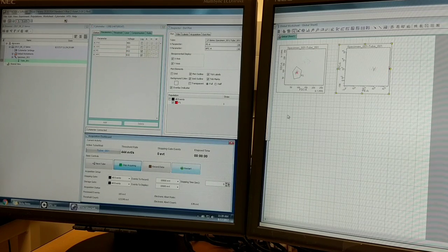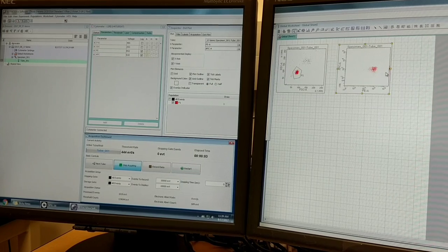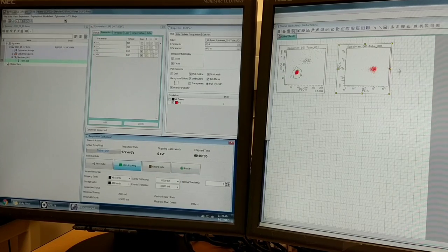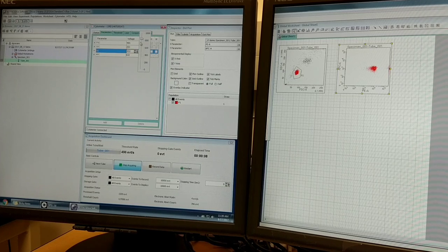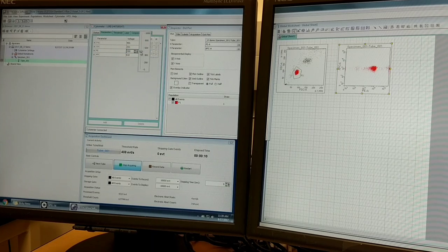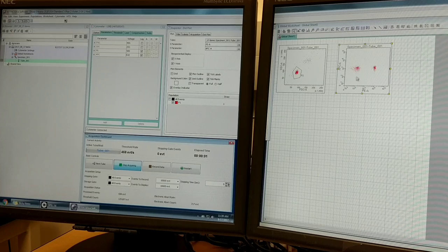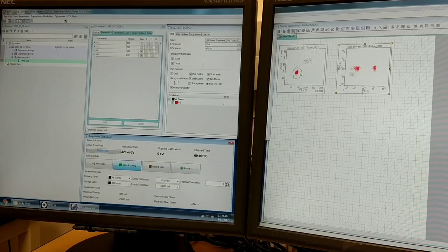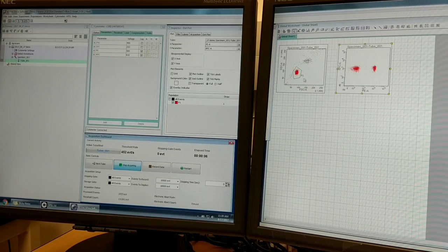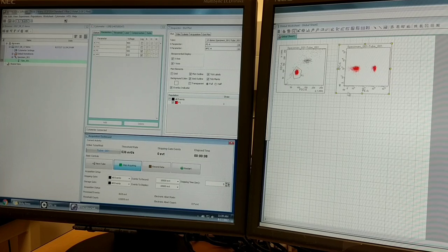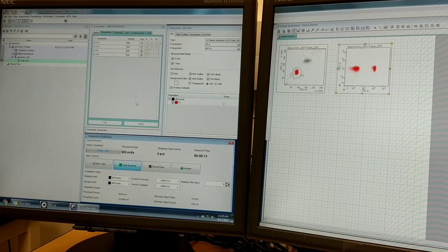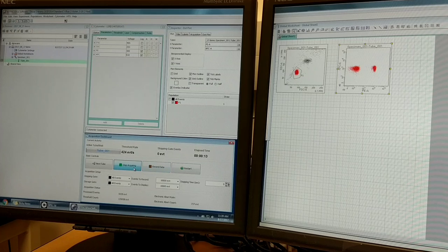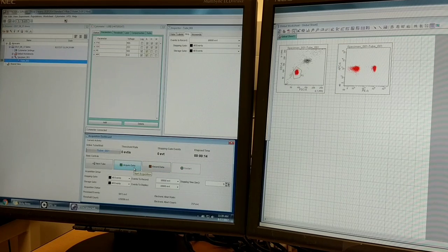The complete extreme is if we went up to 900. Now we've got our data off our axis here. That's extremely poor voltage selection. So let's go back down to 500, where we had about our maximal separation, a 2 log shift. And our background in the PE channel is about 10 to the second. I consider that pretty good. So now I've set my PE voltage to 500. That's where I want it. I'm going to stop acquiring.